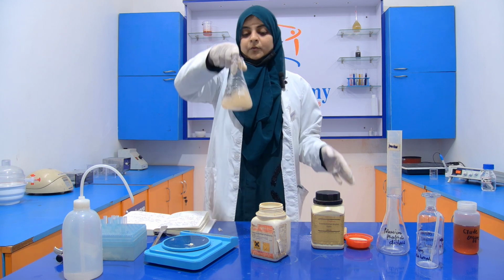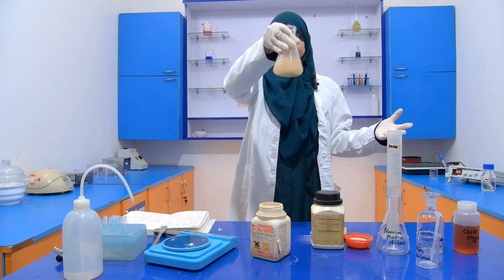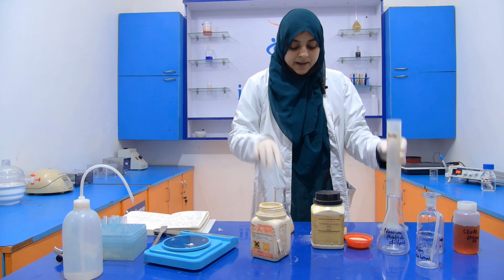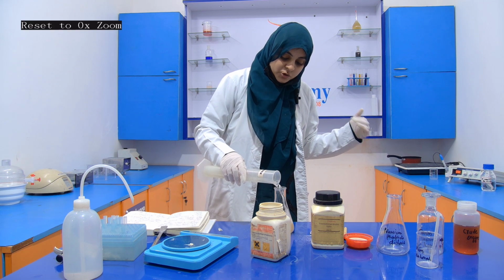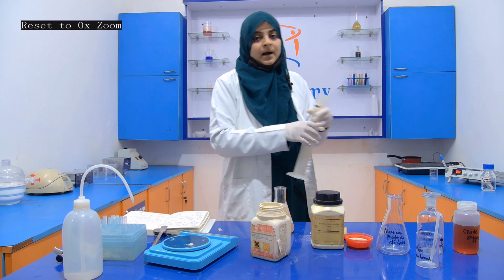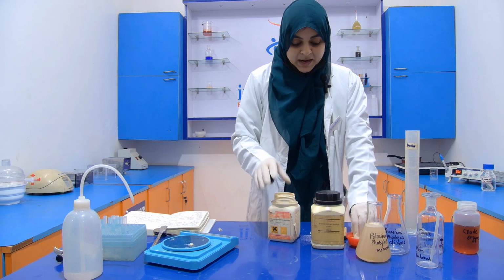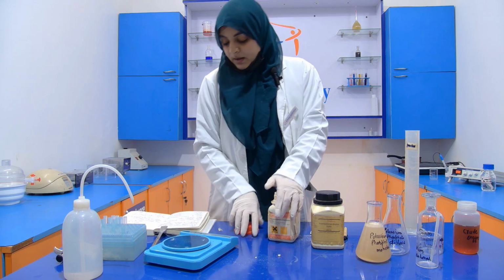Now we have to dissolve it. Say this is your stock solution because the concentration of the monobasic and dibasic is very high. Then with the help of this stock solution, we prepare our working solution that is called a potassium phosphate buffer. This is your monobasic. Now I am going to prepare the second buffer that is your dibasic.